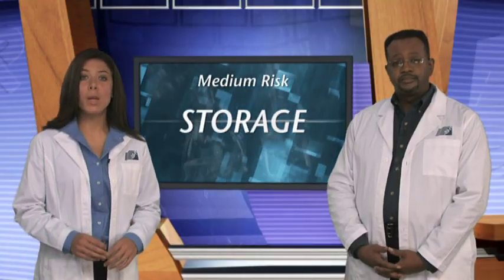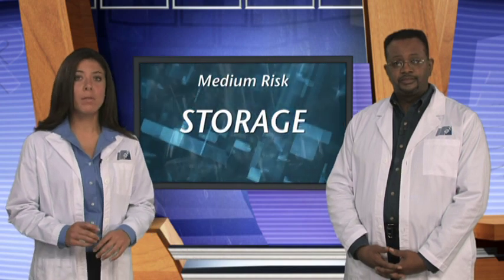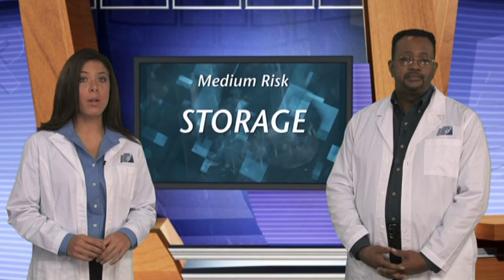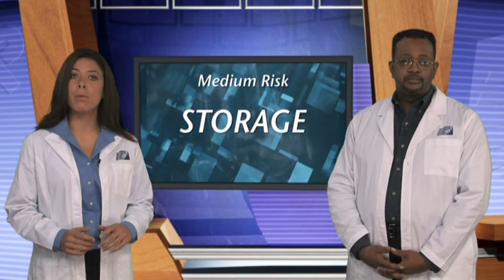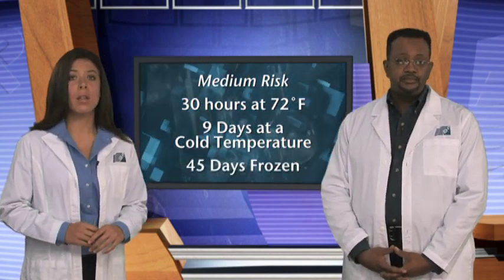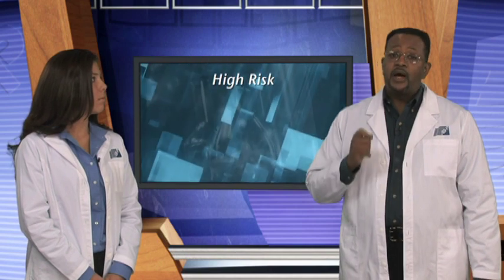Remember, for a medium risk preparation in the absence of passing a sterility test, the storage periods cannot exceed the following time periods. Before administration, the CSPs are properly stored and are exposed for not more than 30 hours at controlled room temperature, for not more than 9 days at a cold temperature, and for 45 days in solid frozen state. High-risk level CSPs compounded under any of the following conditions are either contaminated or at a high risk of becoming contaminated.